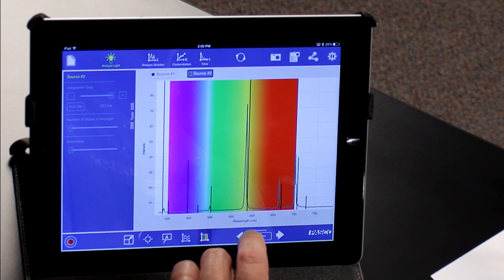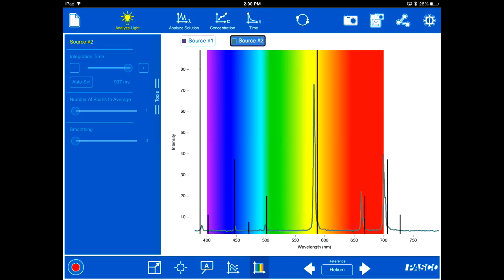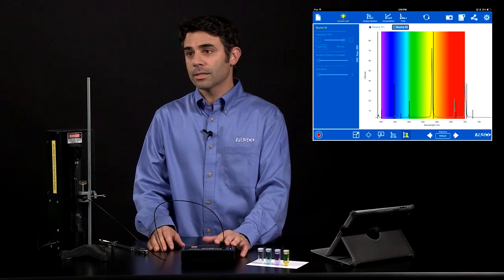So there we have the expected peaks and the experimental peaks. They're very close to each other, actually within a couple of percentage points. So that's analyzing light.